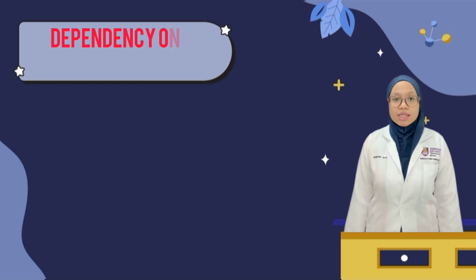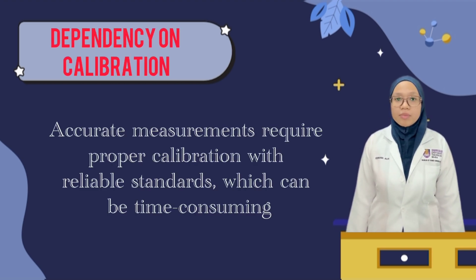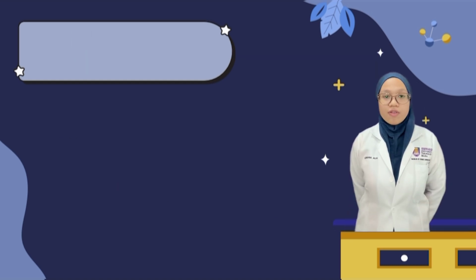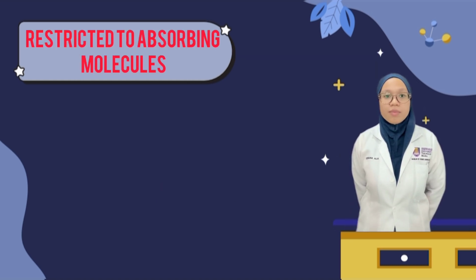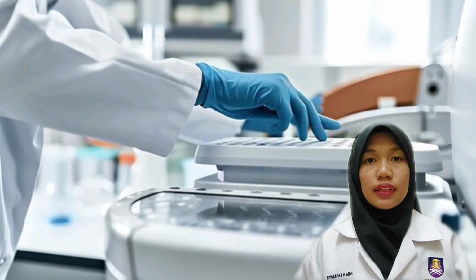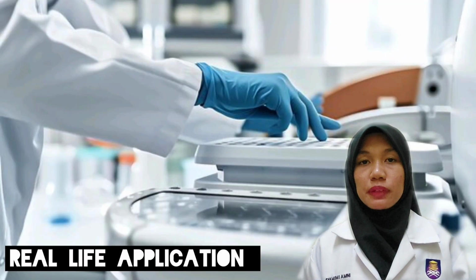Fourth, dependency on calibration. Accurate measurements require proper calibration with reliable standard, which can be time-consuming. Fifth, restricted to absorbing molecules. Non-absorbing compound cannot be analyzed without prior chemical modification or derivatization. In this part of presentation, we will discuss some real-world application of spectrophotometry.